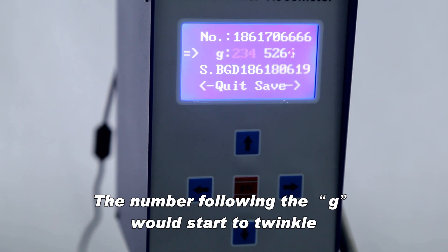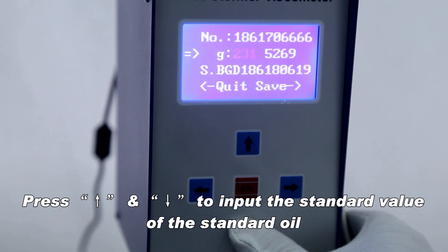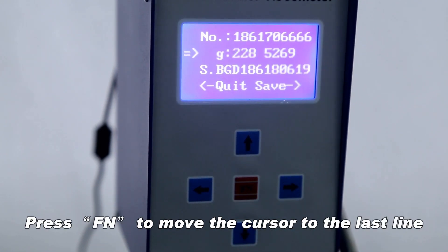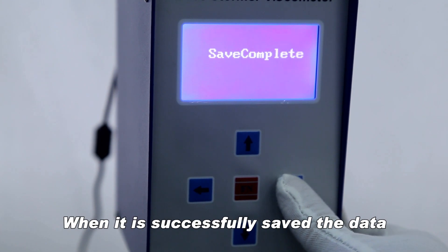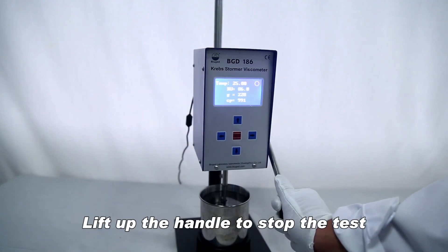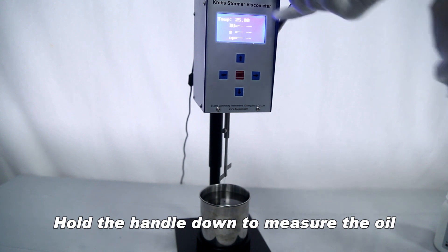Press FN to move the cursor to the second line and press to select it. The number following the G will start to twinkle — press N to input the standard value of the standard oil. Press FN to move the cursor to the last line and press to save the data. When successfully saved, the whole screen will show that the save was successful and return to the main interface.